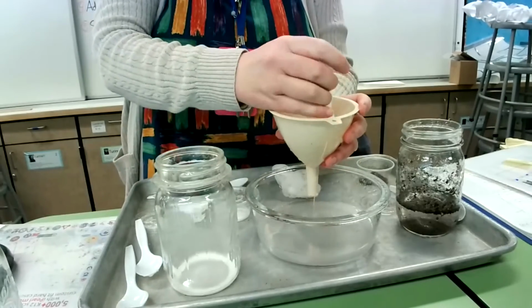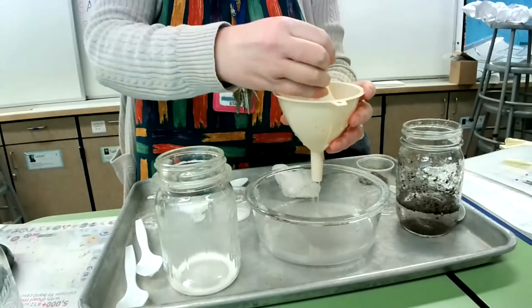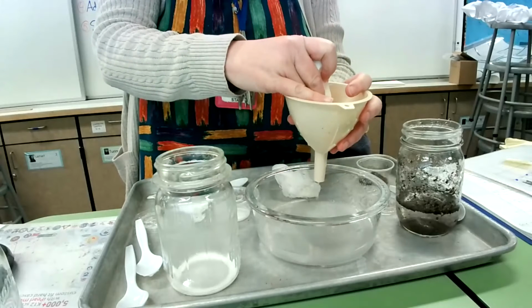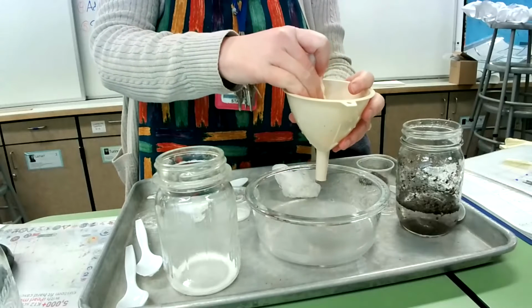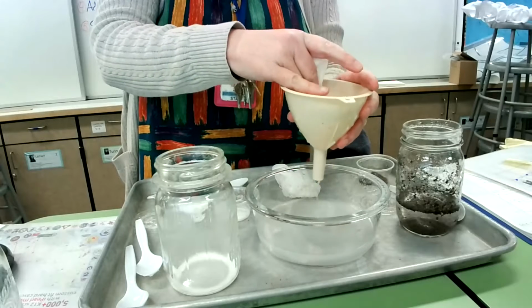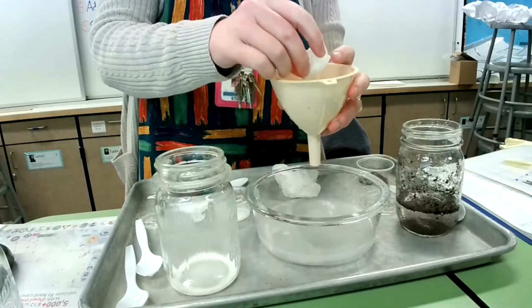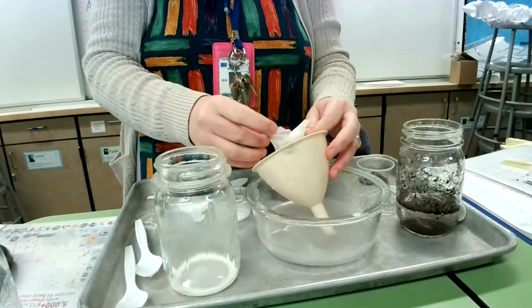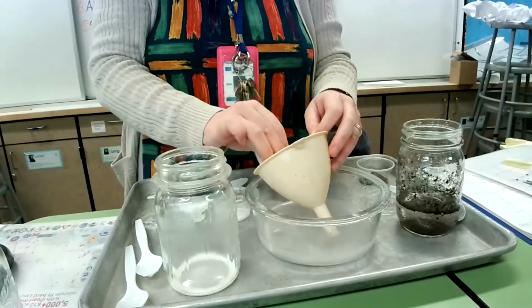I could give this a gentle squeeze and it would go through a little faster. Normally I wouldn't do this, but I'm trying to speed this up, okay? So let's see what's left on that filter.